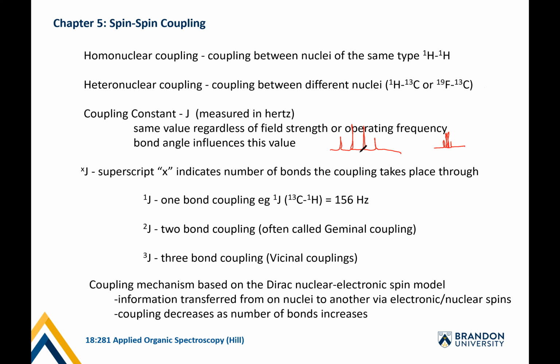The chemical shift here could still be 5 ppm. The middle would still be 5 ppm. The difference is that on a larger field strength, if the coupling constant was 7 hertz, this takes up far less width on the x-axis, whereas on a 60 megahertz machine, it would take up more.